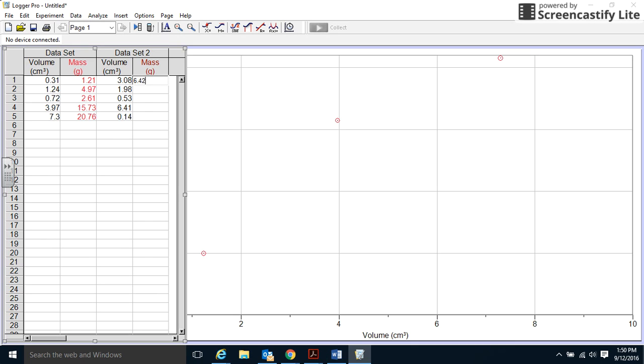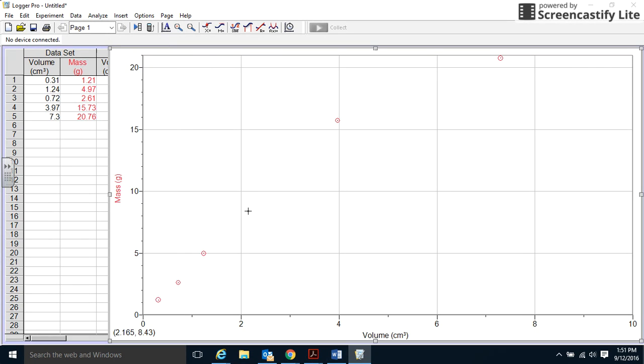Please make sure when you turn in your graph, you're not using these exact same numbers. That's cheating. It should be your numbers that you're using. So if you're watching this video and completing your graph at the same time, make sure you're typing in your numbers.